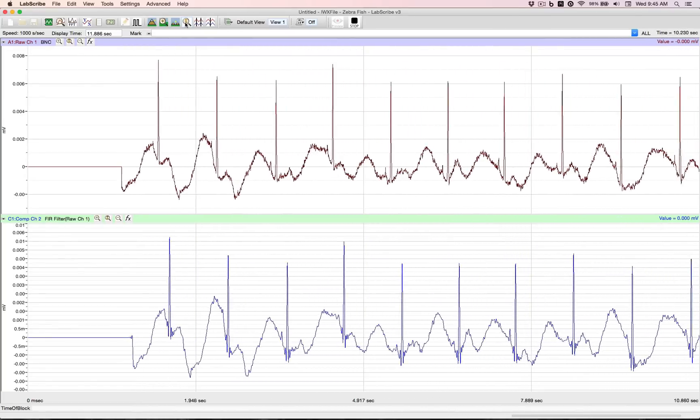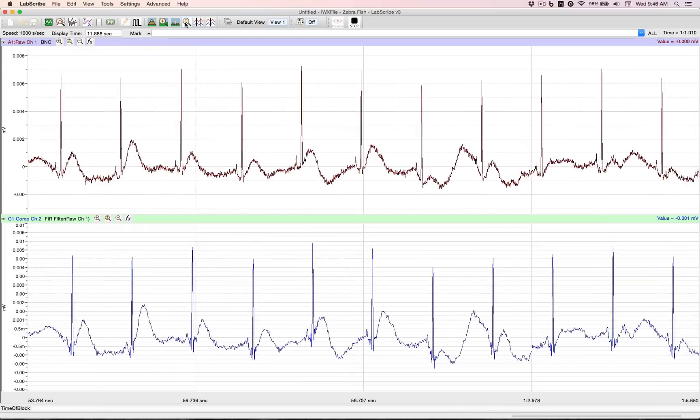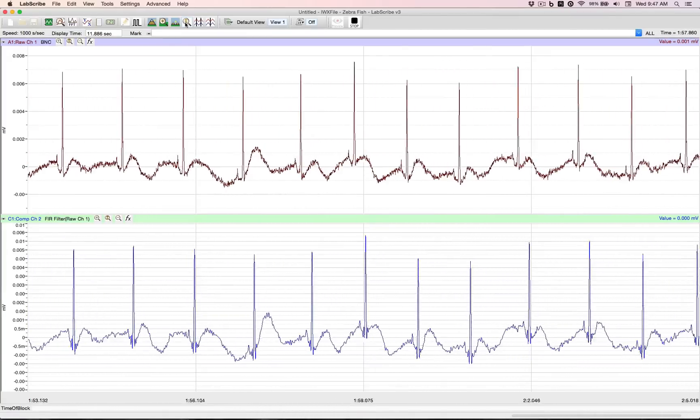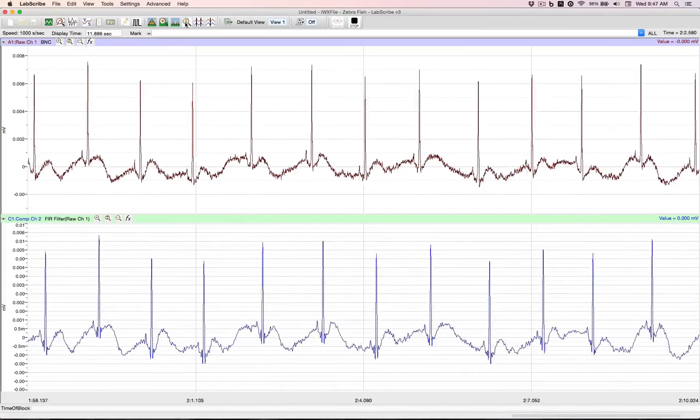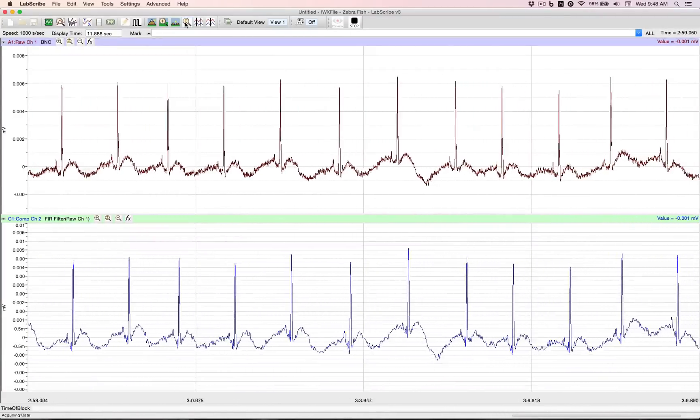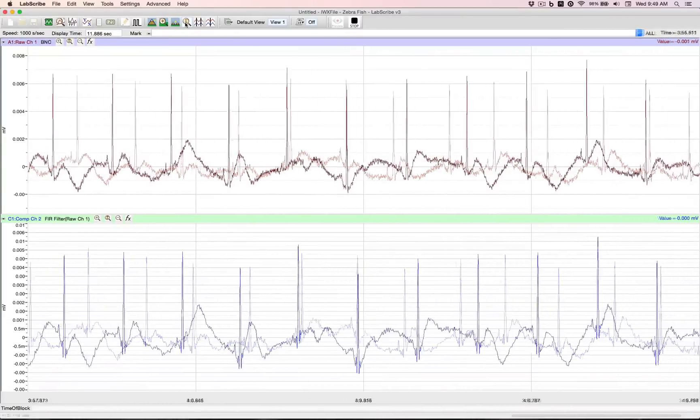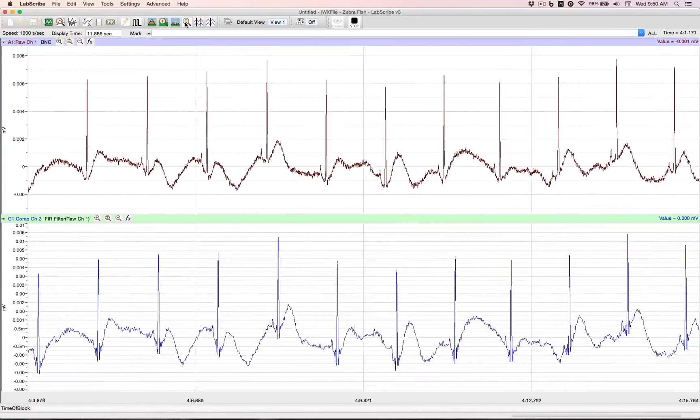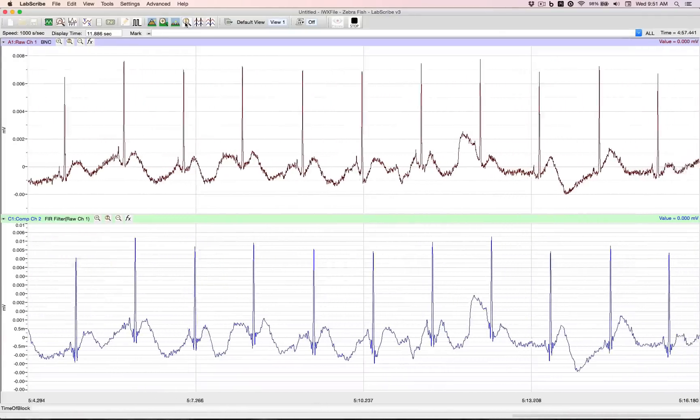And we are going to record for approximately 5 minutes. We are going to time-lapse this. Here's 1 minute. Here's 2 minutes. Here's three minutes, we're at four minutes, and finally five minutes.